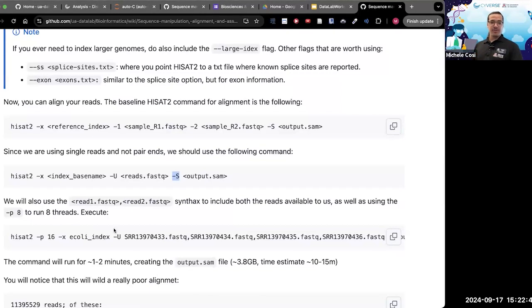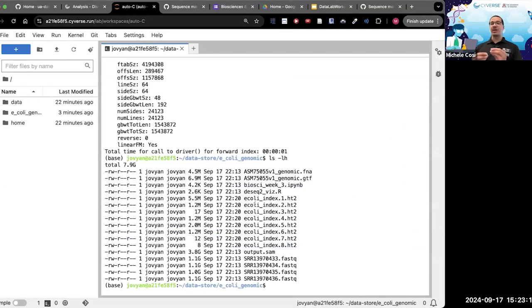All right, so if you do recall from last week, in order to assemble multiple single-read FASTQ files using the -U, you will use a comma in order to separate each file. Now, it is up to you whether you want to run this or not. I'm copying and pasting it into the chat, but forewarning, this runs for roughly 10 minutes.